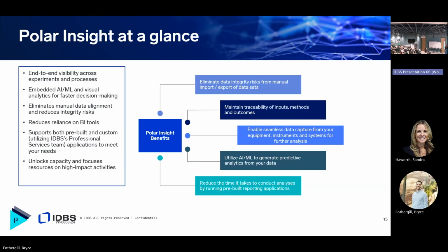You can bring that up to the insight layer, actually visualize it and gain some kind of insight, I guess, from the app. I use Insight way too much. It's a thing.